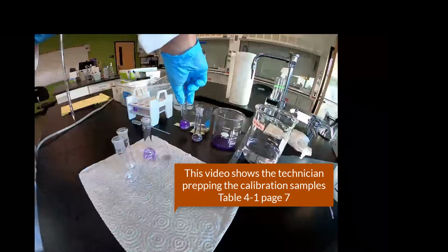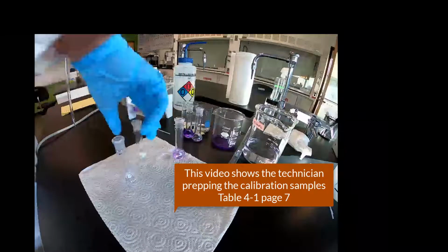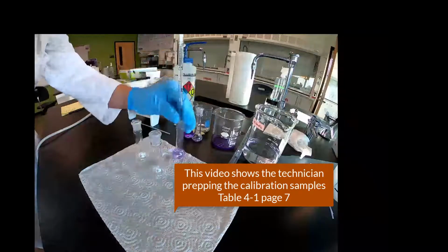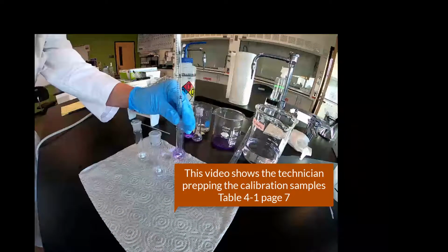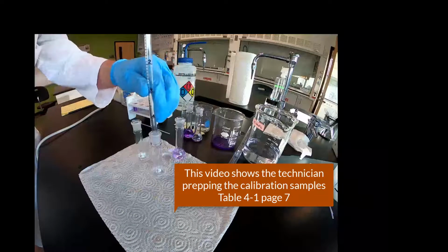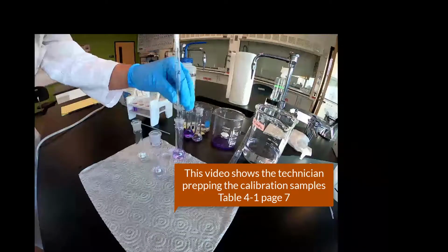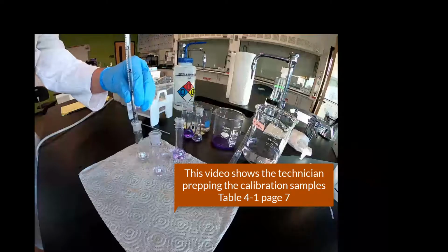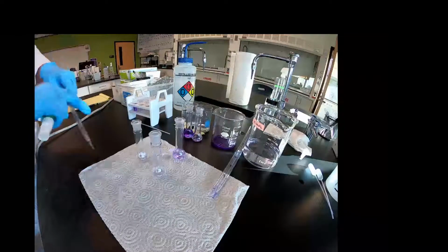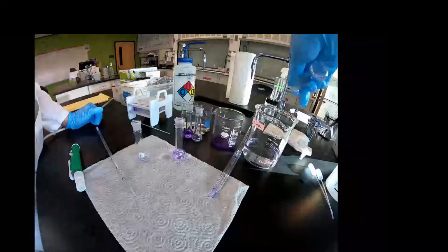So here you go. Now we're ready to work on the dilution of the dilution. This is number 4 and number 5. So that's great. So we isolated out sample 3 by itself. It has plenty left in it. So from there, it's going to make either sample 4, let's see how much volume, or 5, we'll see. All right. But prior to doing that, he's going to go ahead and rinse out those 2 volumetrics.